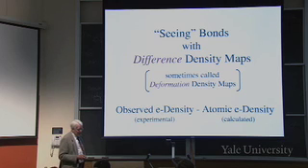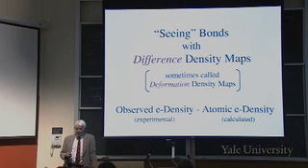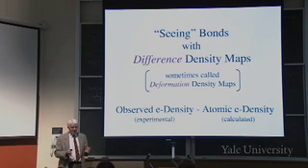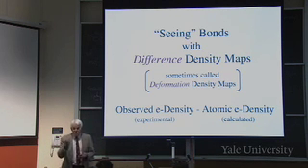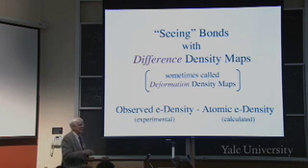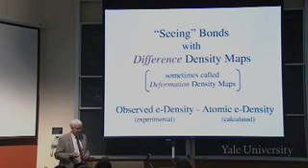Okay, so you take the observed electron density, which is from X-ray, which is experimental, and you subtract atomic electron density, which you calculate somehow. You know what spherical atoms would look like. We'll get to that next, how you would know what that is. But anyhow, when you're going to do the subtraction, you have to make sure you position the atoms properly to be subtracted, right? How do you know where to put your spherical atoms so that you subtract it? Yeah. You put it on the center of those rings, right?